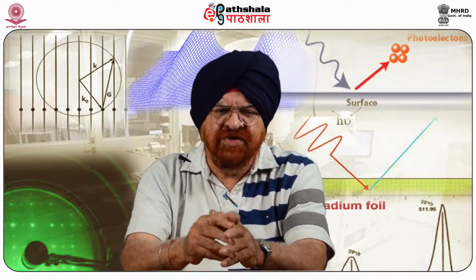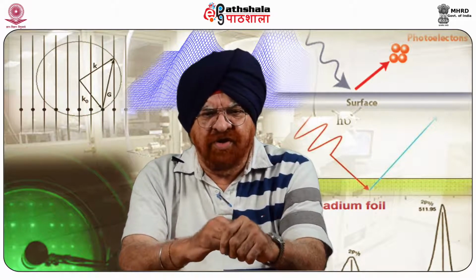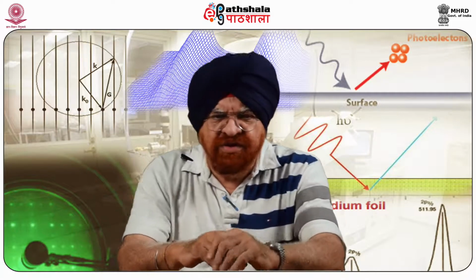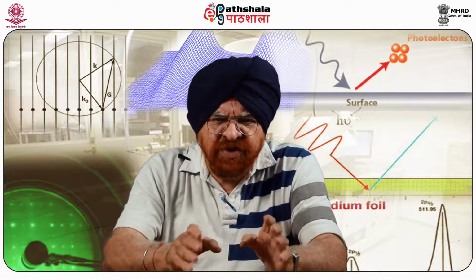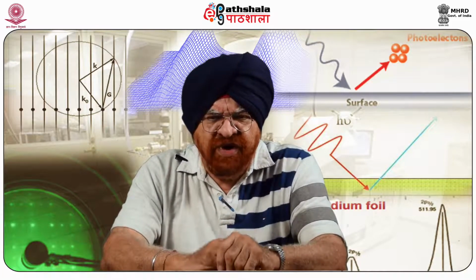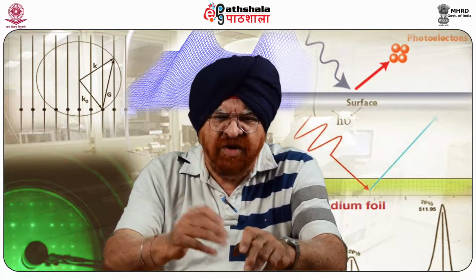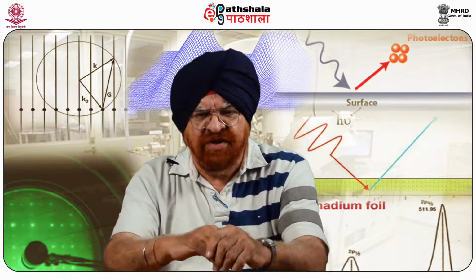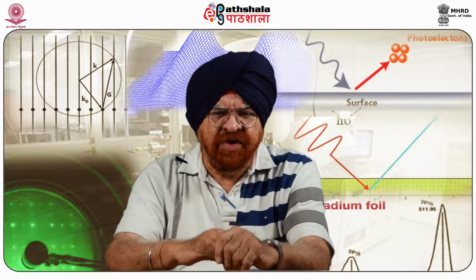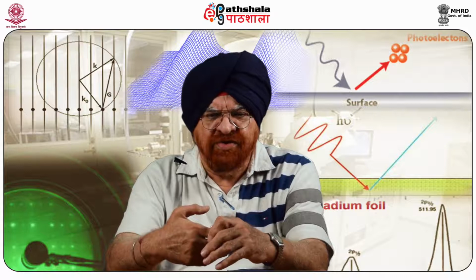The sensitivity of this is also very high. Concentrations down to about 0.1 atomic percent can be measured and detected. Surface specificity is another benefit, wherein less than 10 nanometers of material, if it is there, one can find out with the help of ESCA. Then the biggest advantage is ease of analysis. Minimal sample preparation time is required, and you can get very accurate results.